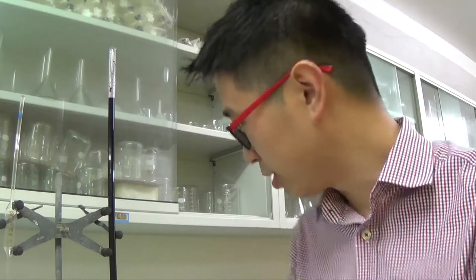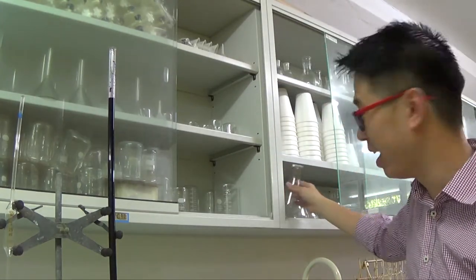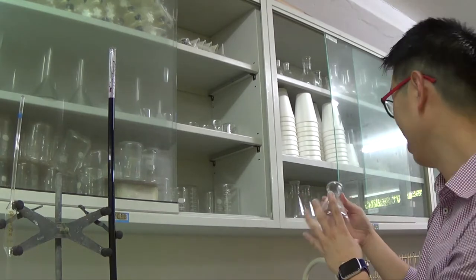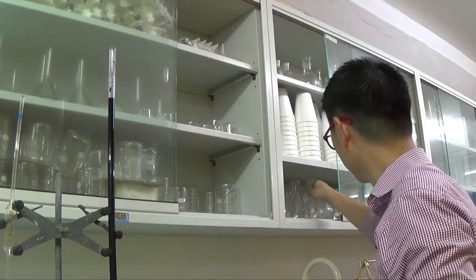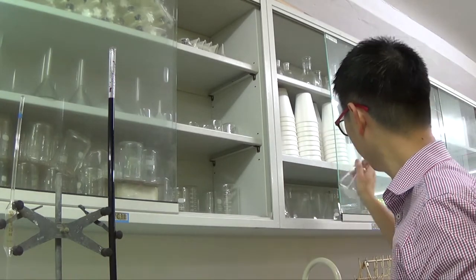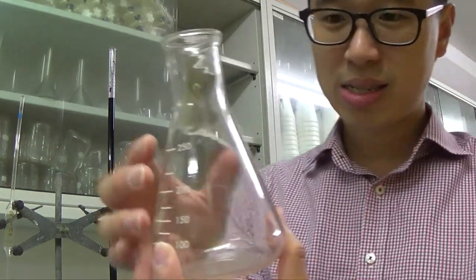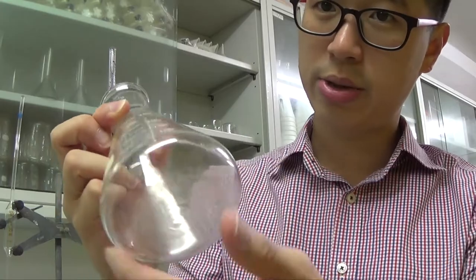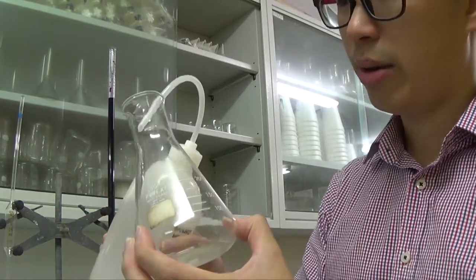So I was running around looking for the conical flask, and it turned out that the conical flask was just behind me in the cabinet there. Okay, I can leave with this. Can leave with this as well. So this is a conical flask. As you can see, there might be a little bit of stain on the side. So it's best if you wash it with distilled water, not tap water.